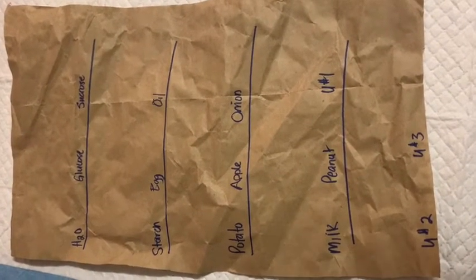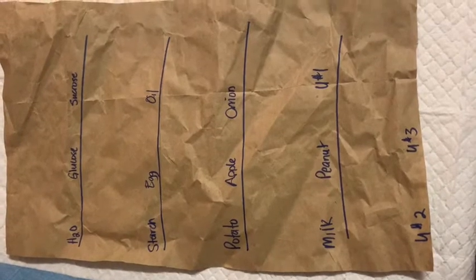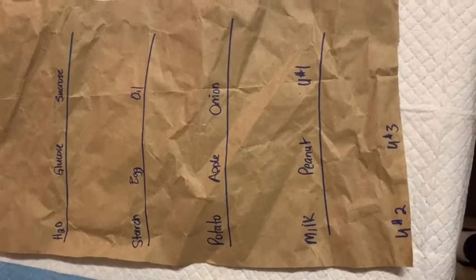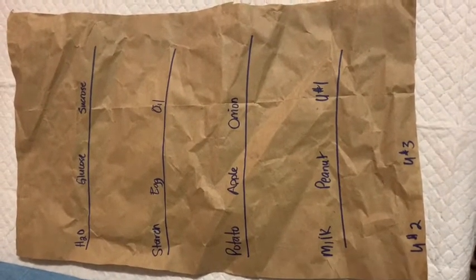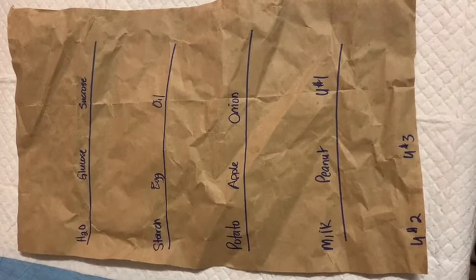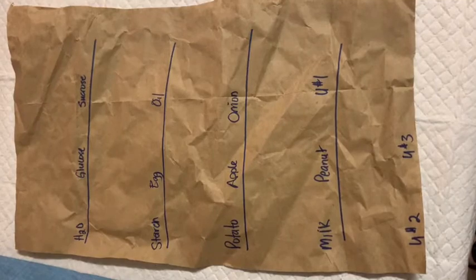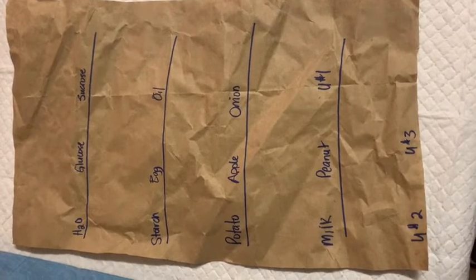The test for triglycerides - fats and oils - is going to be a little bit different than what we've been doing. This is a simple piece of paper from an Amazon package; you could also use a paper bag. We're going to take each of these foods and put a spot above the labels and let them dry. If there are no triglycerides or fats and oils in the food, the spot will disappear. But the presence of fats will make the paper translucent and shiny - kind of like when you spill oil on a t-shirt and it's almost impossible to get off.